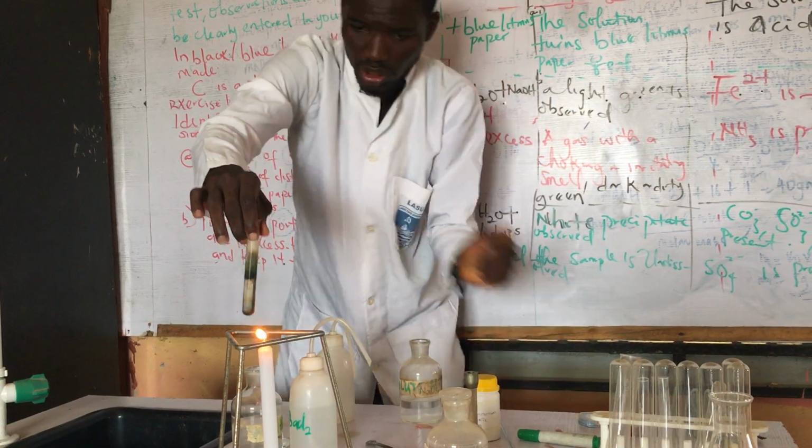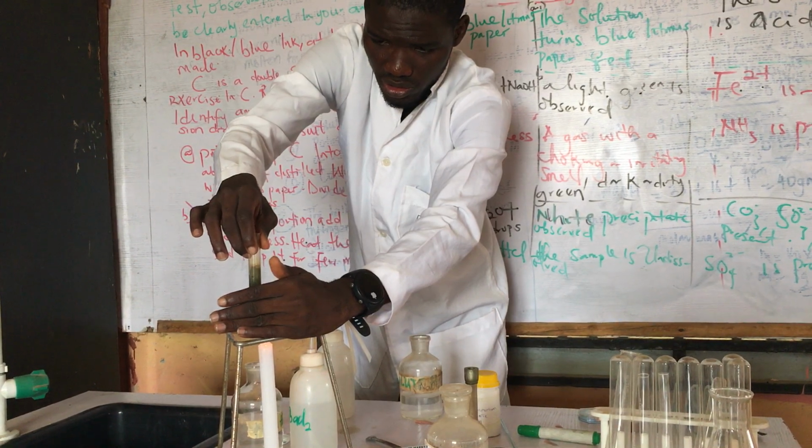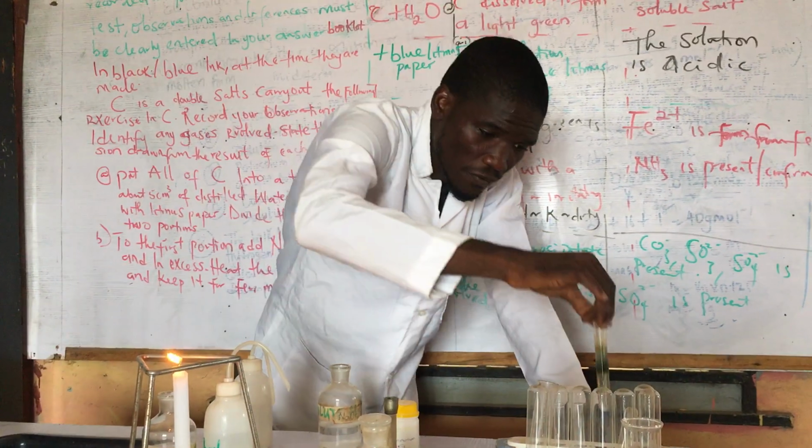That is among the instructions stated. Okay, so let's keep it for a few minutes and let's see the effects.